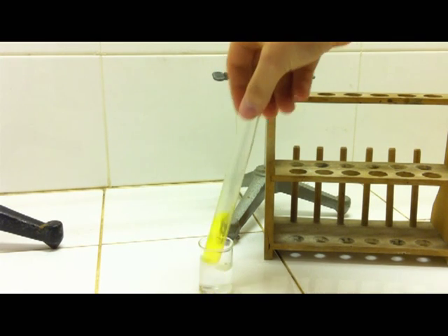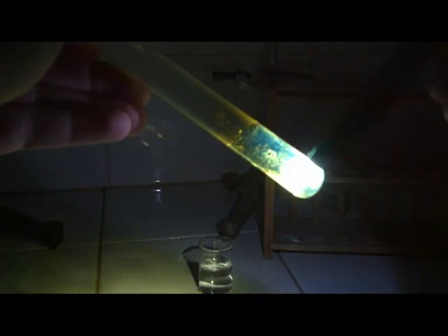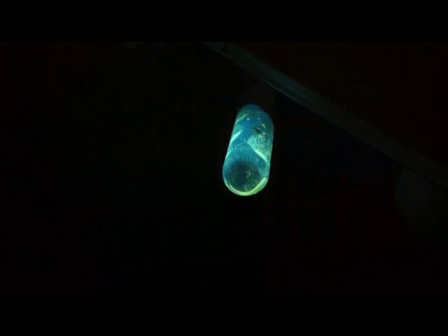After it is cooled to the temperature of the water, I am going to illuminate it again, and what you can see here is the effect of delayed emergence of light, also known as phosphorescence. The simple process of fluorescence only takes place under the illumination of light and does not sustain after the light is shut off. In this case, you can see the glow keeps on for a few seconds, and is really bright as well.